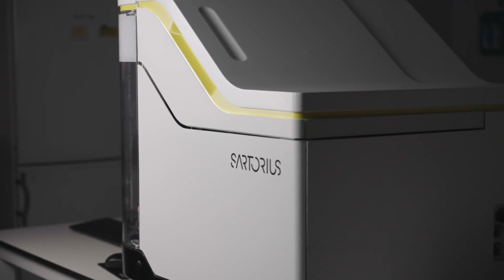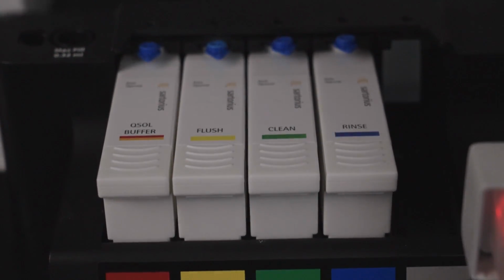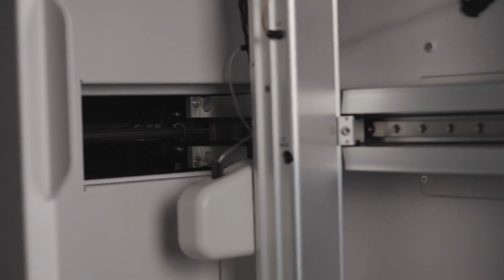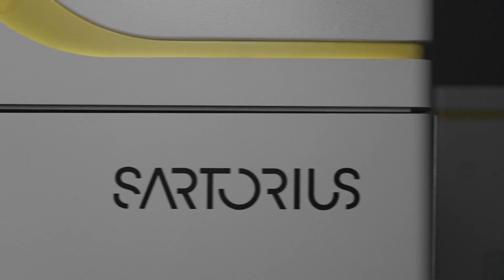Today I'm going to walk through some of the considerations and best practices for panel design for the iQue HTS instrument. This is one of the most critical elements for designing a flow cytometry experiment, particularly when using large complex mixtures of antibodies. Proper design will ensure that the panel of antibodies and fluorophores used will generate the best possible data from your sample.